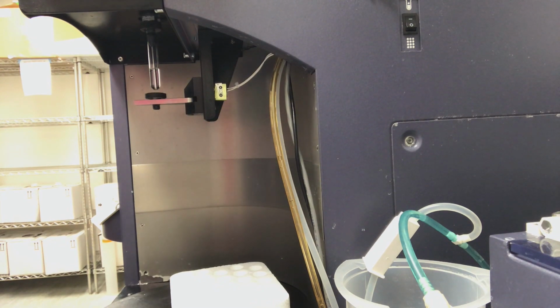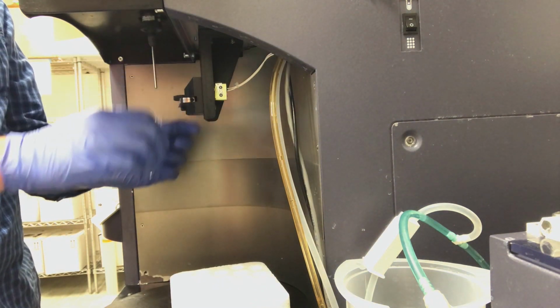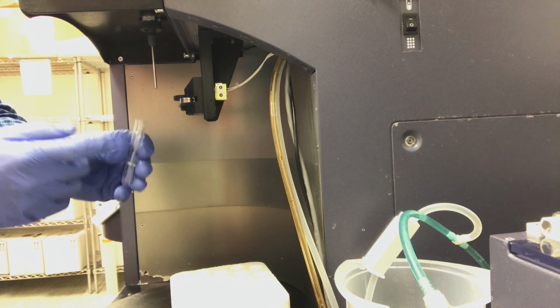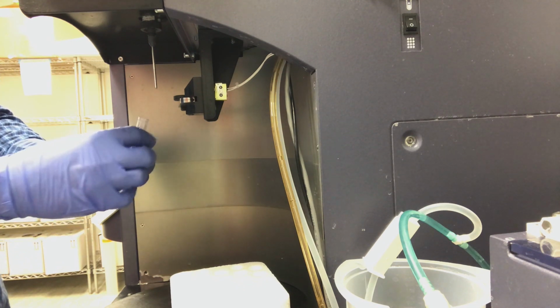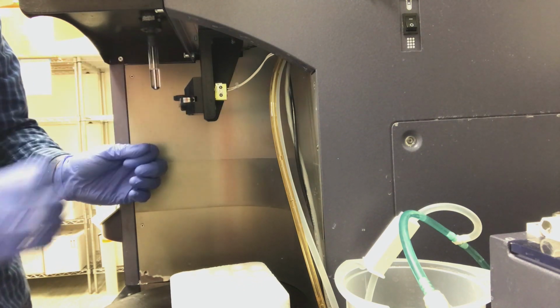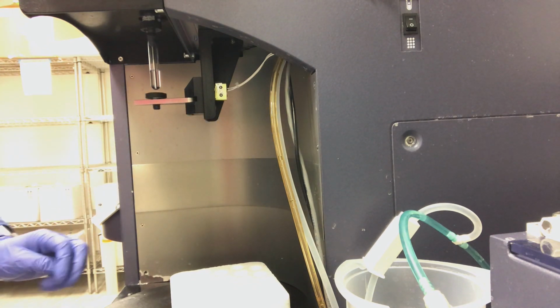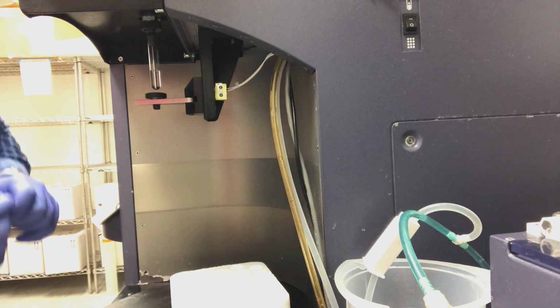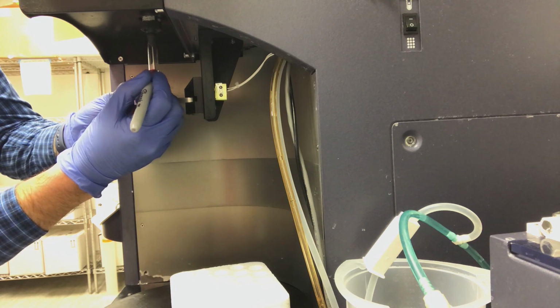So at this point, we do have a real clog. We want to make up a tube of bleach, about 2 mLs of bleach and water. We'll load the tube on, center the arm, run on high, and at that stage, I want you to come over and mark where the meniscus is.